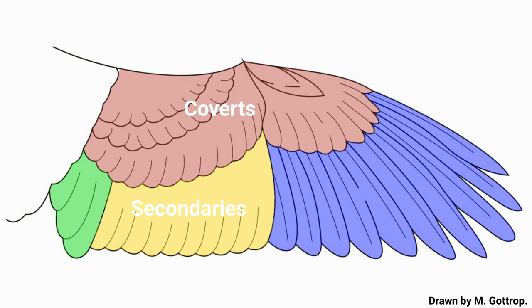On the distal portion, anteriorly, a small set of alula feathers sit atop the primary coverts, which lie atop the long primaries.